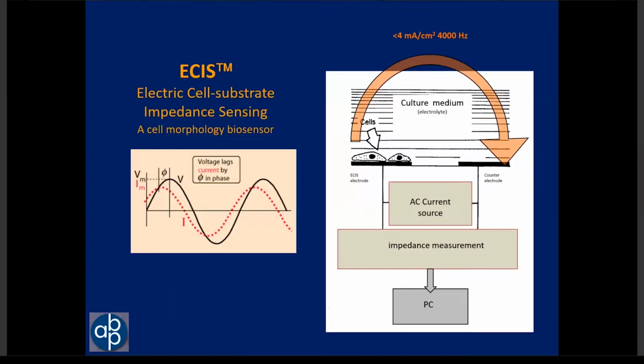We monitor the voltage. That's indicated by the black solid line. But notice the two do not peak at the same time. We would say that the voltage is lagging the current by a certain number of degrees, thinking of the total sine wave here as one cycle up and down as 360 degrees.